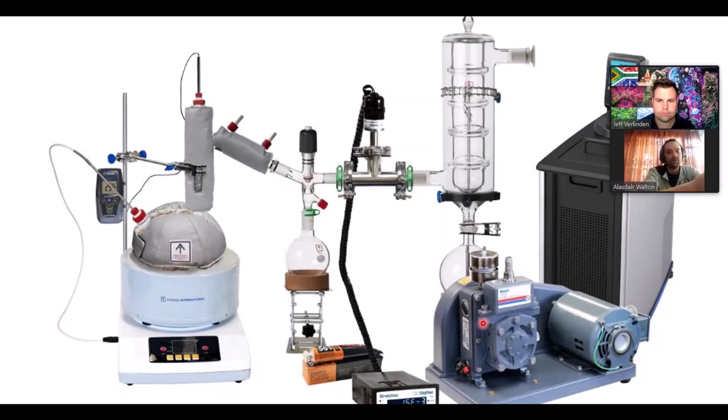You can see it by the vacuum gauge, which is between the collection flask and the cold trap. So what we'll do then is pull the vacuum as deep as it goes. And once we're at our ultimate vacuum, or at the vacuum we're happy with, we will start heating the mixture. As we heat the mixture, certain molecules will start boiling off, and they'll travel up, as you're pointing out there, to what we call the condenser. That condenser will be cooled or heated, depending on how you want to go, but I think we'll get to that at a later stage. And that mixture will then drop down into the collection flask.